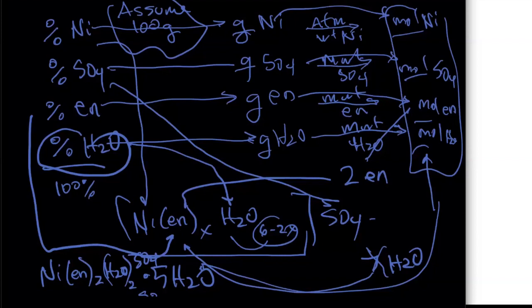That's basically the calculation for this. It's pretty involved because there are many parts, but all this is Chemistry 200 stuff. It's basically just calculating moles, and it's calculating percent based on the part of each component divided by the part of the sample that you have.